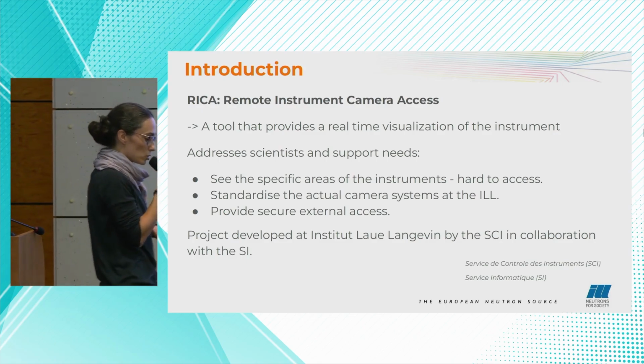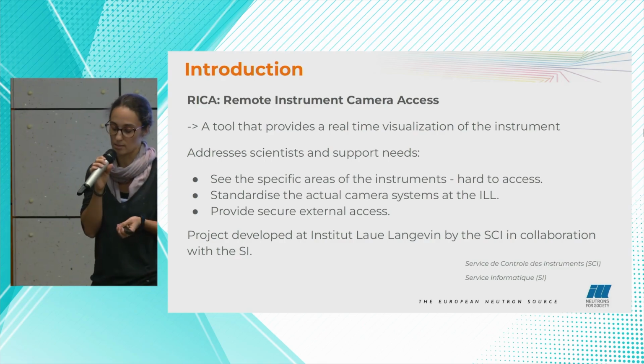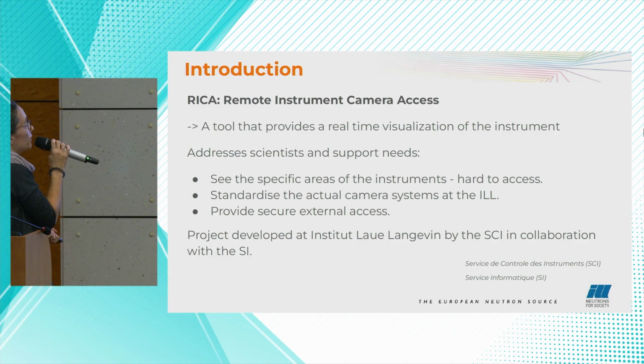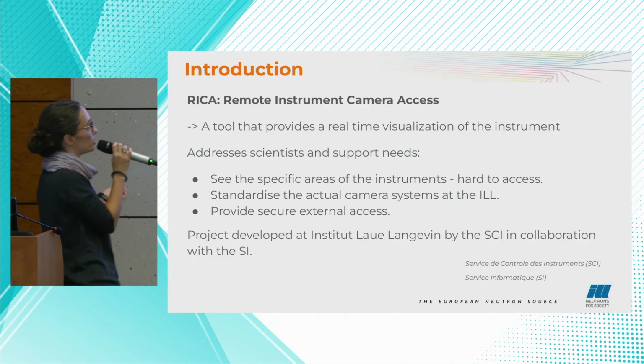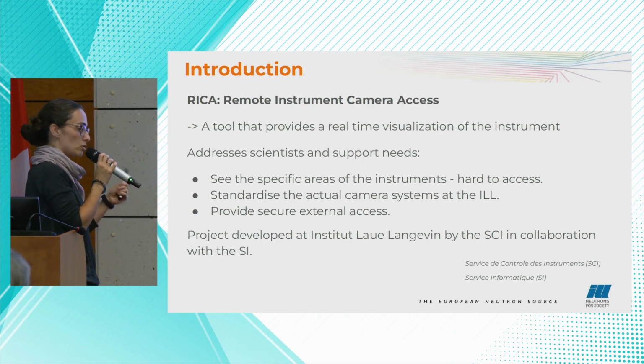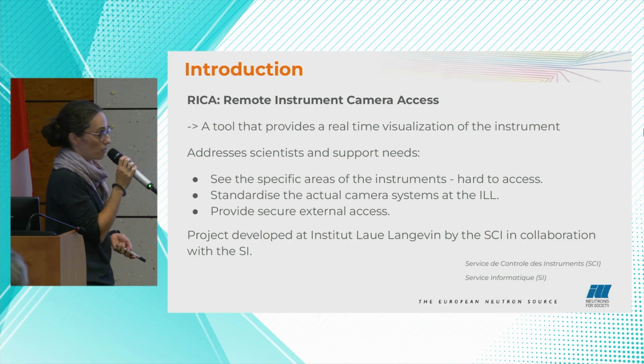We also needed, and this is more for the technical staff, to standardize all the camera systems that were already present in our institute. And finally, we wanted to provide external access. This goes along with the idea of having remote access to the instrument. This project was developed by a collaboration between two services at our institute, the Service de Contrôle des Instruments and the Service Informatique.